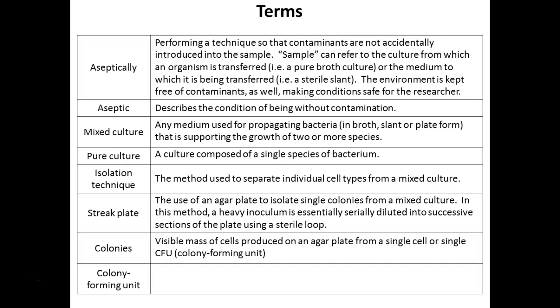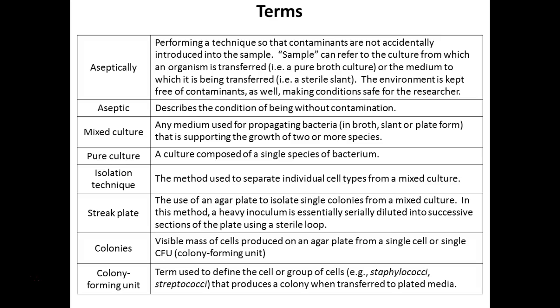Can you tell by just looking at a plate or a slant that you have a pure culture? No, you'd have to do tests, right? So as we're doing tests, if you see abnormalities, then we may need to assess the situation. We may have some contamination, either from the beginning, hopefully not, or along the process. So when those colonies form, especially when we're counting them, we use the term CFU, which stands for colony forming units.